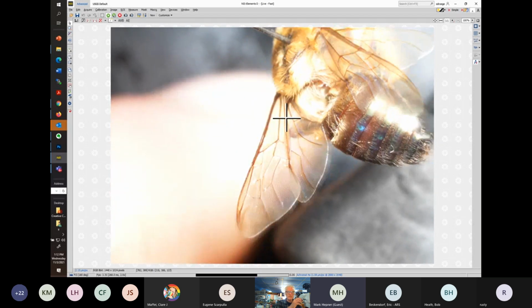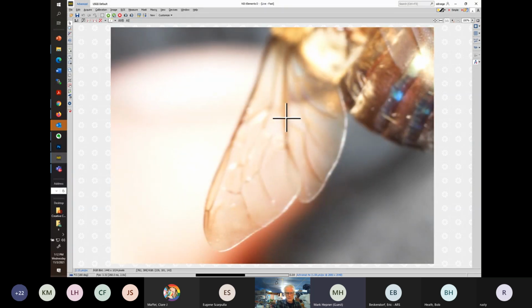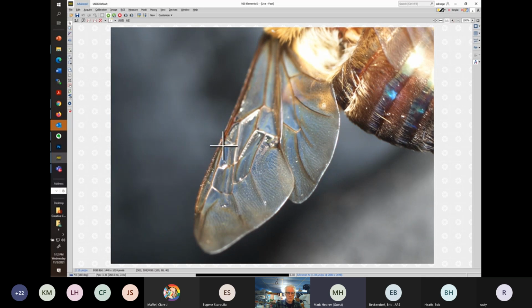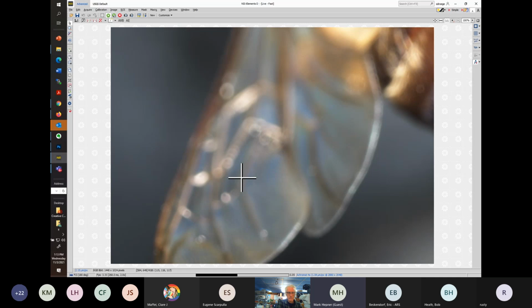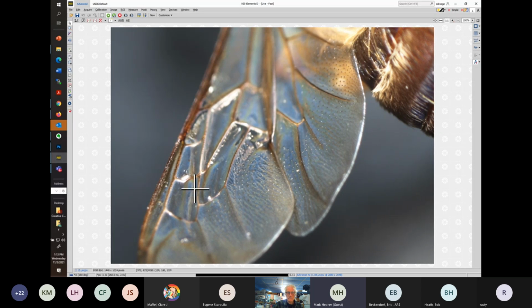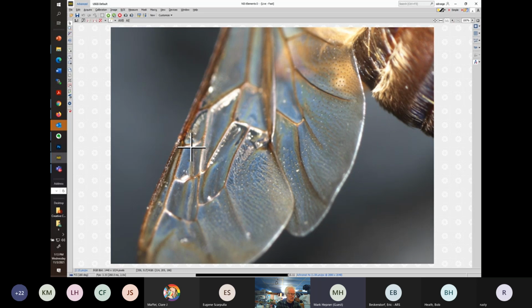So back to the wings. If we expand up here, looking at the wings, take a look at a couple things. One is you can notice, look at the length, very Xylocopa-y marginal cell. Super long compared to the width. It does have 3 submarginal cells there. And then when we go a little closer, it's looking like there aren't any hairs, and indeed there are not in these interior cells, which leans us towards other groups. That's a relatively uncommon state.